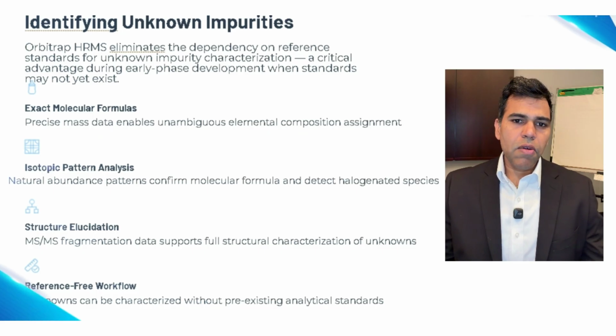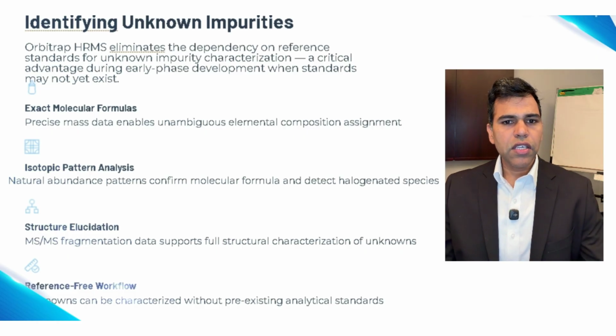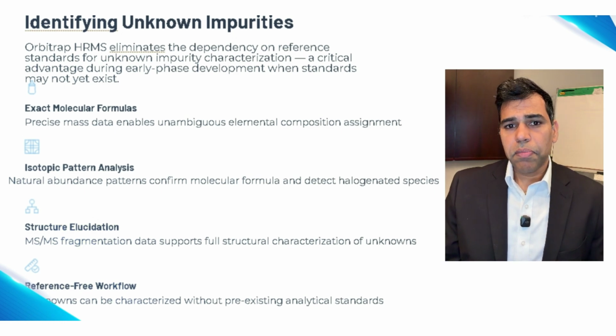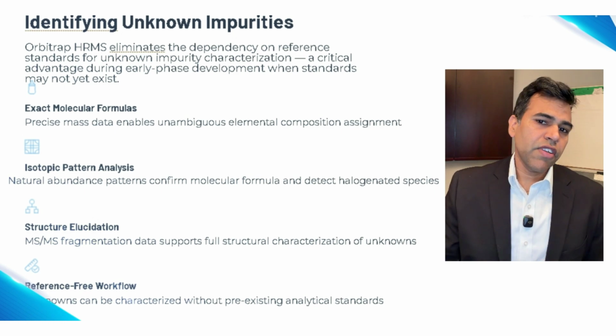So let's talk about identifying unknown impurities. One of the most powerful and honestly most underappreciated capabilities of Orbitrap is the ability to characterize unknowns without a reference standard.